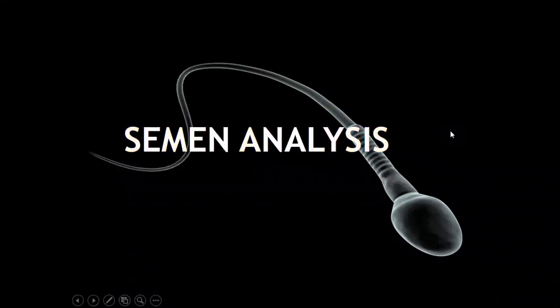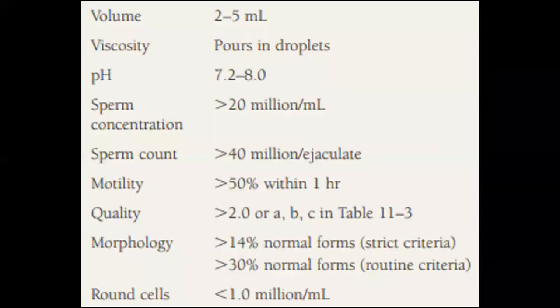Okay, so now let's talk about the different procedures involved in semen analysis. These are the normal values that you need to take note of when doing semen analysis. So these are the parameters reported. First, the volume of the specimen. Take note that the normal volume for your fluid is 2 to 5 ml.